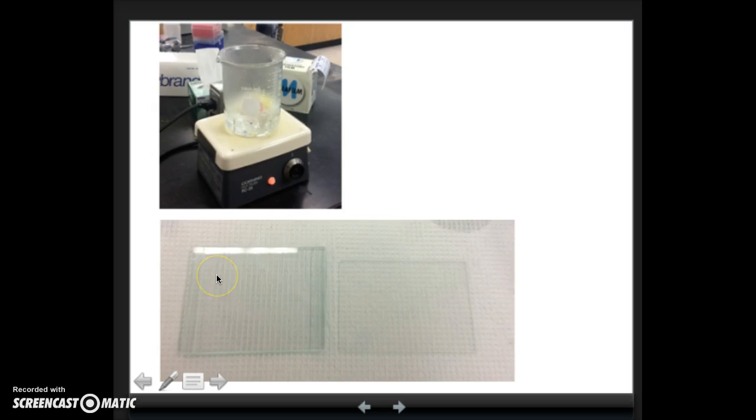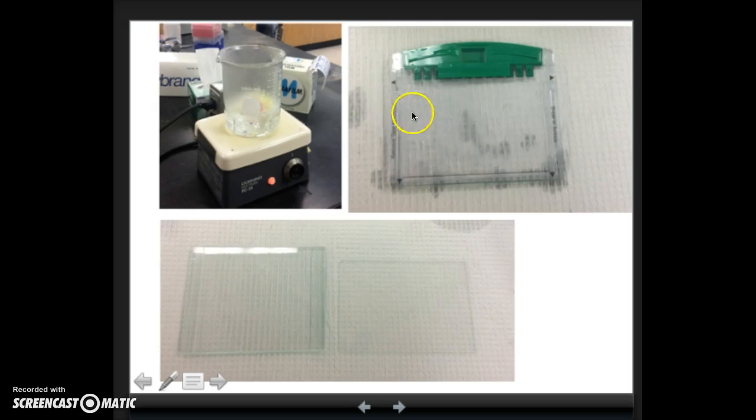You pour stacking gel over top of that, and that's the gel that you can insert a comb in so that when you remove the comb, you'll actually have wells in that polymerized gel, and you can load your samples. Here's what it looks like after you've done this. This is actually a gel we purchased precast. The gel is between two plastic plates, and here's the comb that they inserted to form the wells as this was all polymerizing.